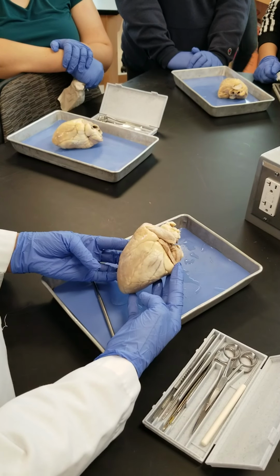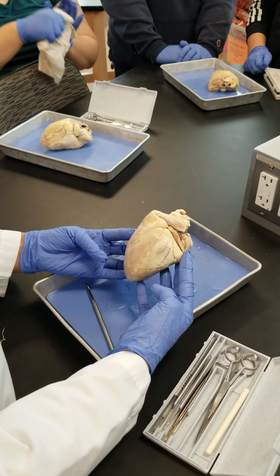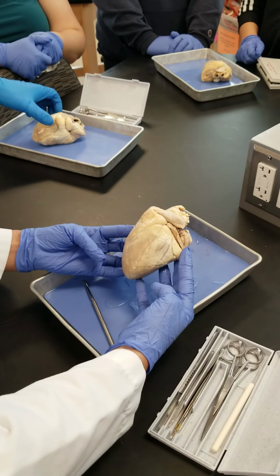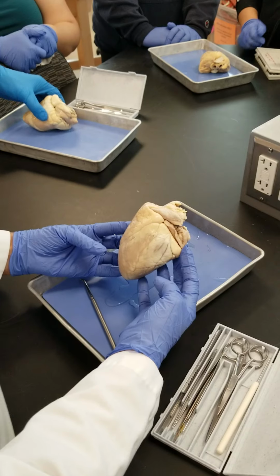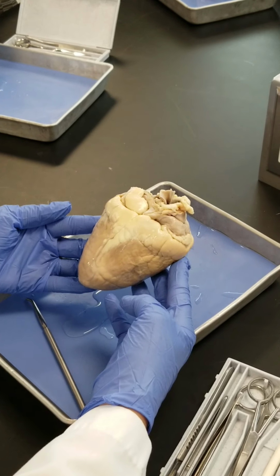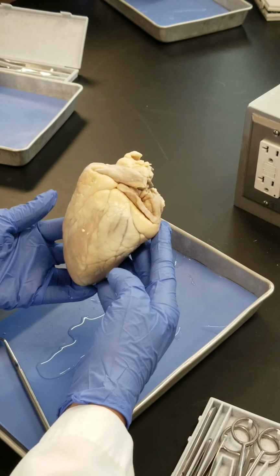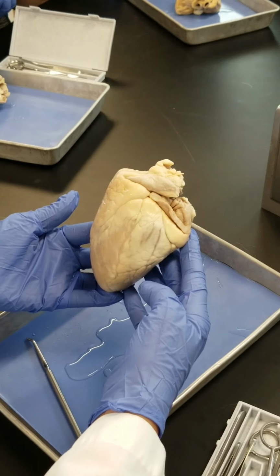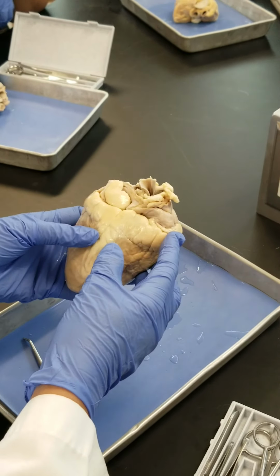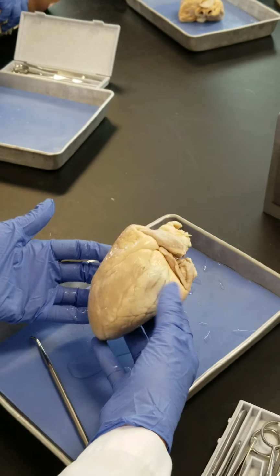So the best key for recognizing the structures of the heart, the clue for the outside, is to recognize the anterior of the heart from the posterior of the heart, right? So look at all the holes that you have in hand and tell me which side is anterior, which side is posterior. You see that one side is like this, the other side is like this, right? Tell me which side is anterior, which side is posterior, and what is your reasoning? Why do you call one side anterior, the other side posterior, right? Tell me, what do you think?